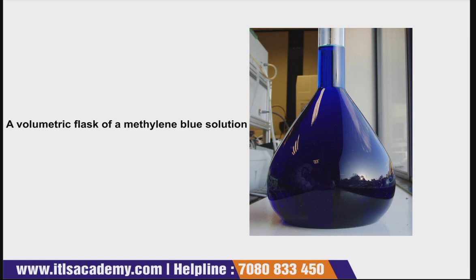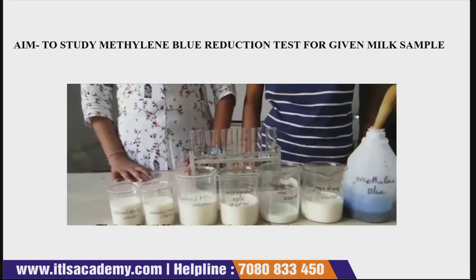So why is there a need to study the methylene blue reduction test for the given milk sample? As we all know, one of the best media for the growth of microorganisms is milk, because milk provides very favorable conditions for their growth. Both raw milk as well as pasteurized milk contain varied types of microorganisms.